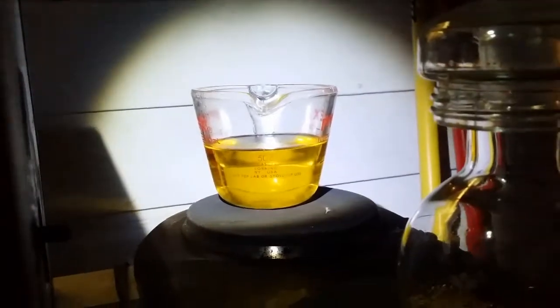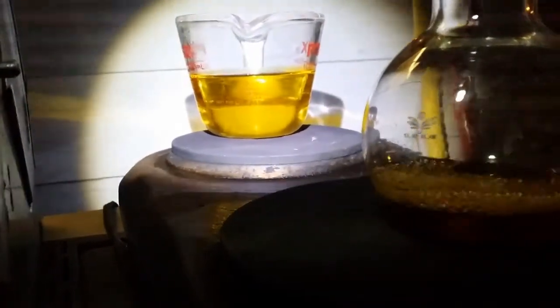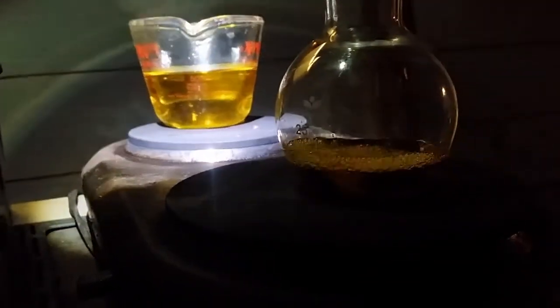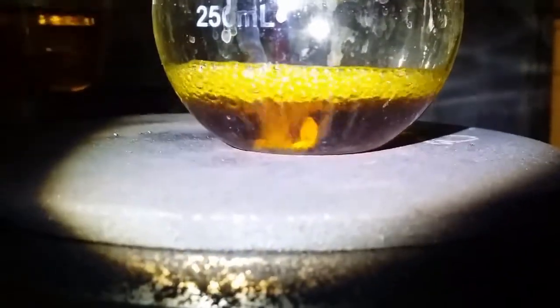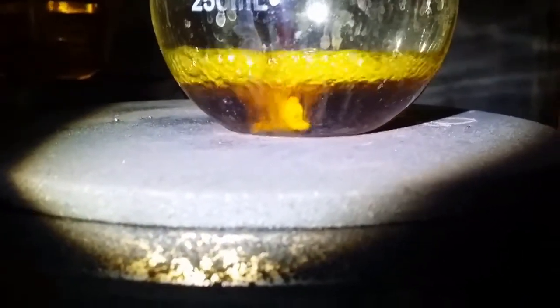Not the first time this has happened, but with heat, that solid precipitate seemed to have kind of disappeared. So I'll make sure that I try to take care of that when it runs down to a lower solution, because it will probably precipitate out again. I just wanted to point out that the epoxy came off of the tooth. It's kind of bouncing around to the side of it. Kind of funny. So the epoxy did not dissolve. This tooth has to be just about gone. It's got to be very thin by now.